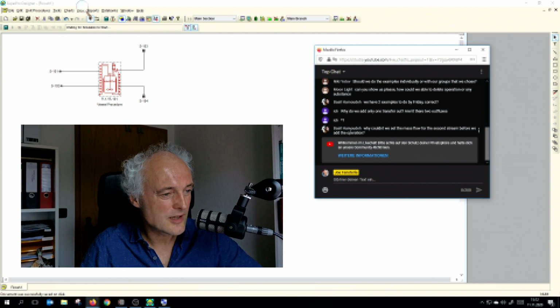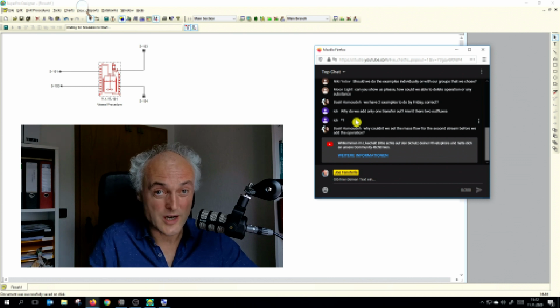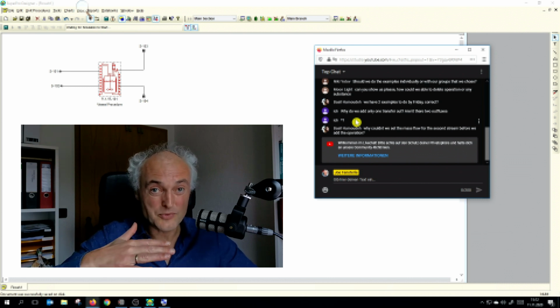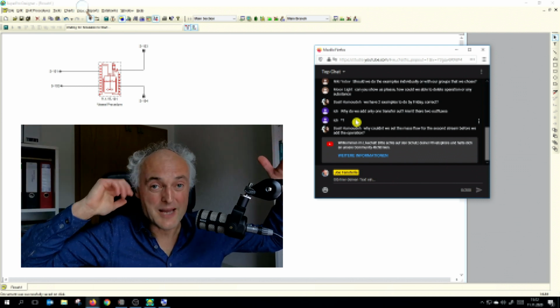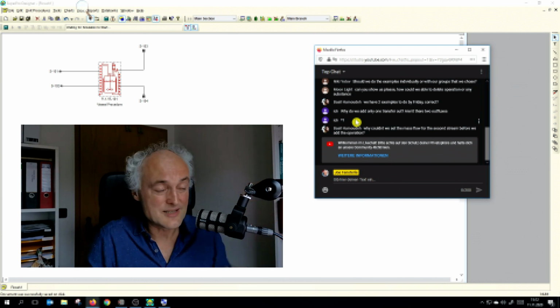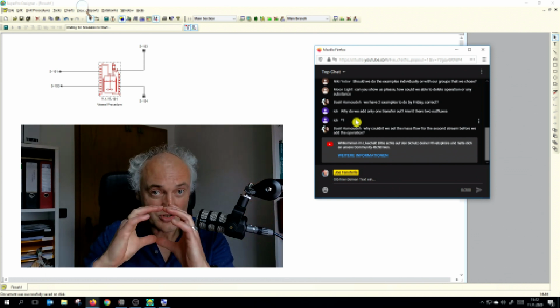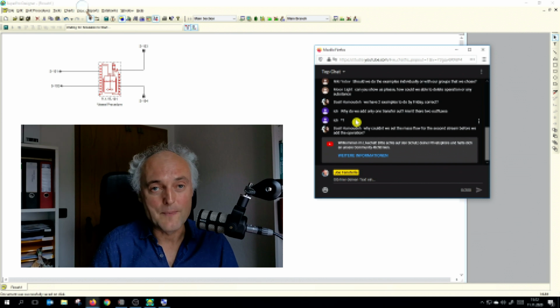Aren't there two outfluxes? It's a good question. We come to this transfer out stream, but it's an aqueous solution. So at the end, it's all in one. So we need to add two charge operations because we pump these in separately. Even if there is no separate pipe for charges, you always use a different port. But then it's mixed inside there, and it's in just one tube at the end. So therefore, in this case, there is no more need to have a separate stream. It's one phase.